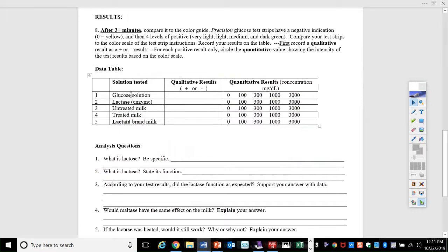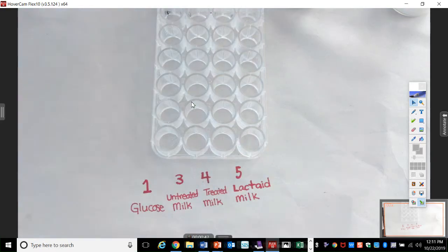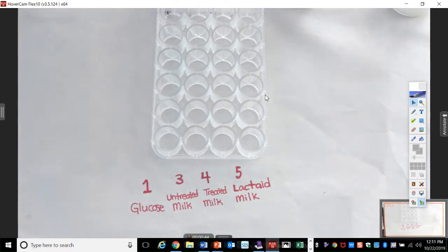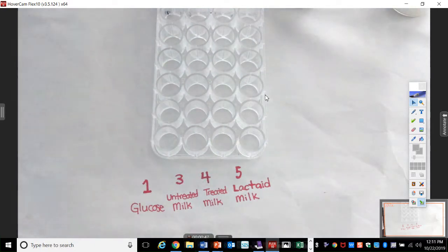But as we fill in this chart, you're going to grab some drops of each one of these. Here they are.